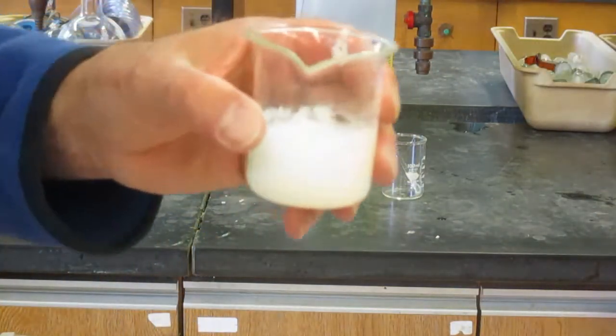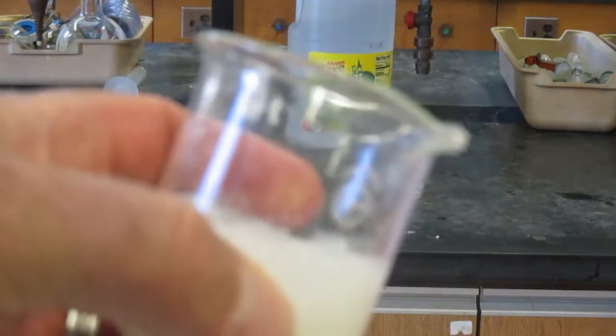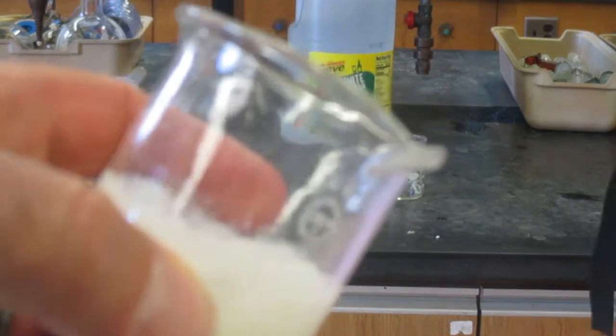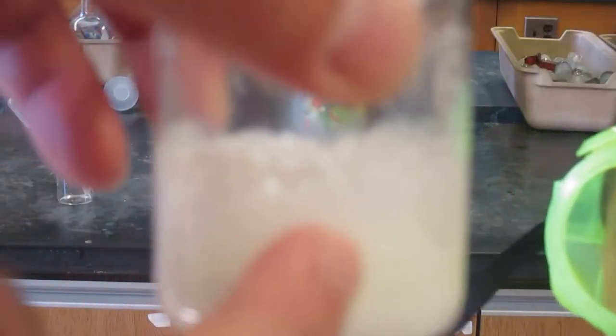Now clearly what you can see here, it didn't really quite become colorless, but if you look at the side, you can see that you have some chunks along the edge of the beaker, and that's going to be your casein. So now the next step we're going to show you is how to separate this. If you let it sit, you can start to see that it becomes sort of colorless and it begins to separate. And it starts to separate here, so there you can start to see the casein.